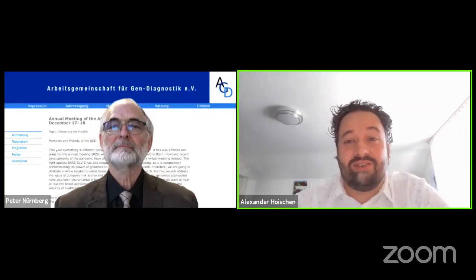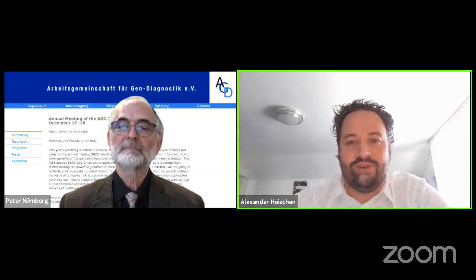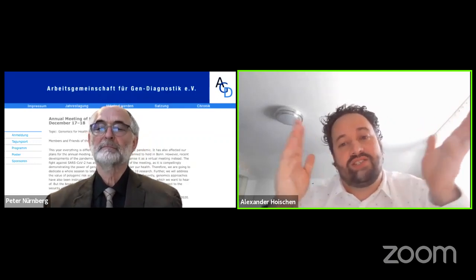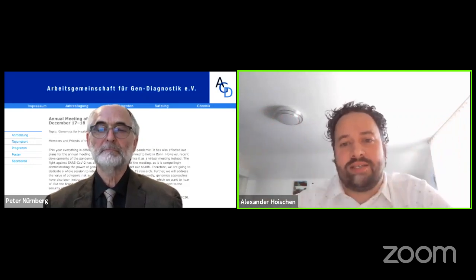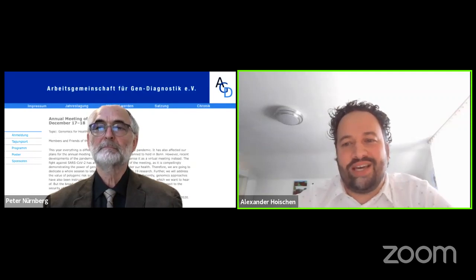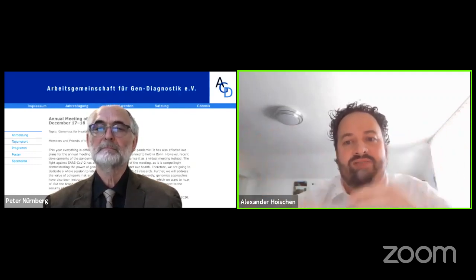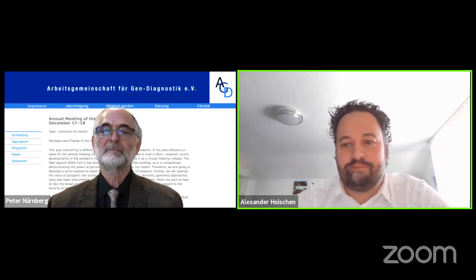I think in the constitutional study, there is at least 7 classical microdeletion duplication syndromes in there. All of them are detected, but for full honesty, not all of them are detected by both tools. So it's sometimes that the CNV tool is more sensitive because in the super long segdups, the assembly may be disrupted. But I've seen new data that even has improved. So you can subassemble only the very long molecules, and you can really bridge regions like that. And I think Joris Vermeesch has shown that for the very complex DiGeorge region.